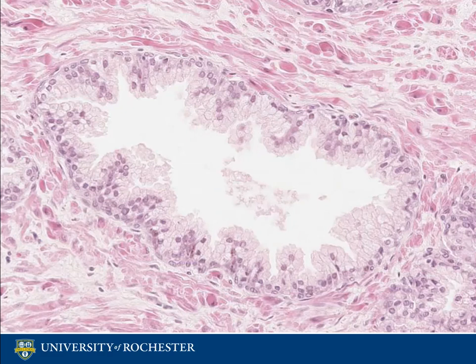The stroma contracts during ejaculation in order to expel any intraluminal glandular secretions. You can also see a layer of basal cells located between the epithelium and the stroma. These basal cells aid in the regeneration of epithelial cells. Note that the majority of normal epithelial cells of these glands do not contain nucleoli, whereas basal cells do.